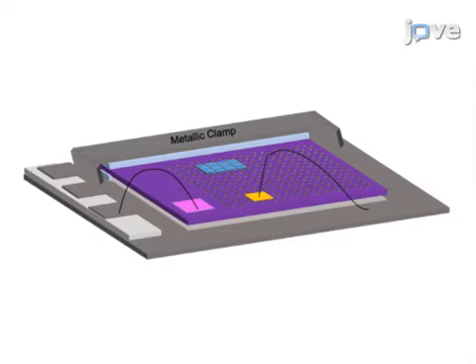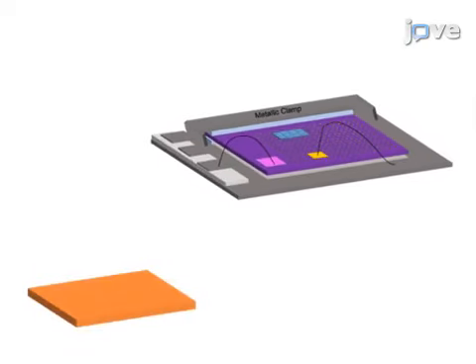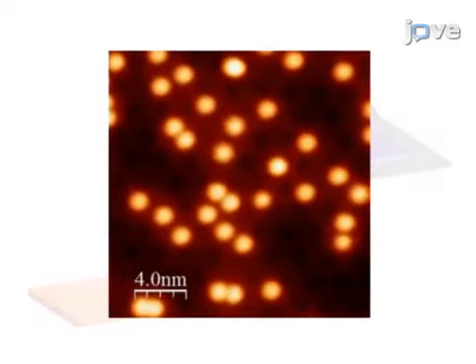microscope sample holder. The final step is to calibrate the scanning tunneling microscope tip on a gold 111 surface and to evaporate Coulomb impurities onto graphene in an ultra-high vacuum environment. Ultimately, scanning tunneling microscopy is used to image the Coulomb impurities on the gate-tunable graphene device and to investigate the spatially dependent electronic structure of graphene in the presence of charged impurities.